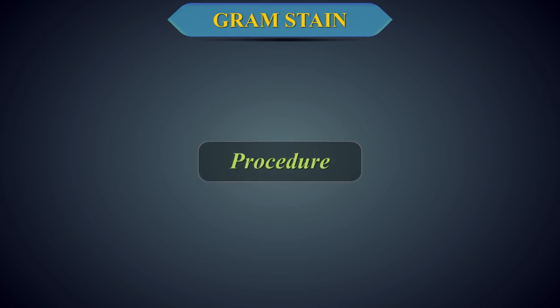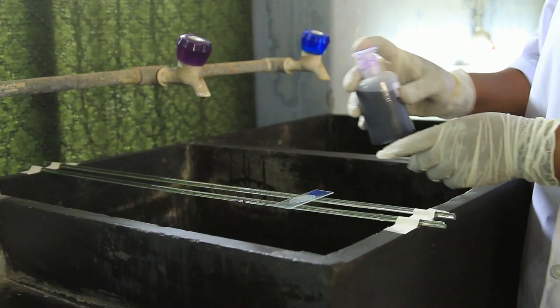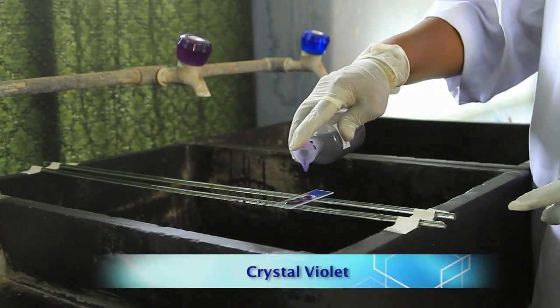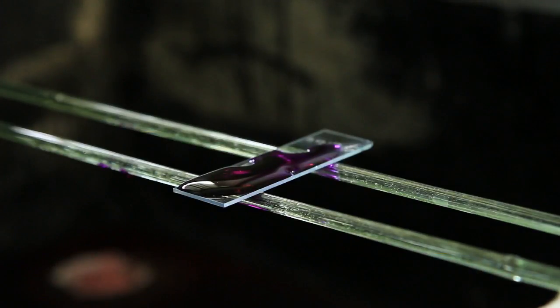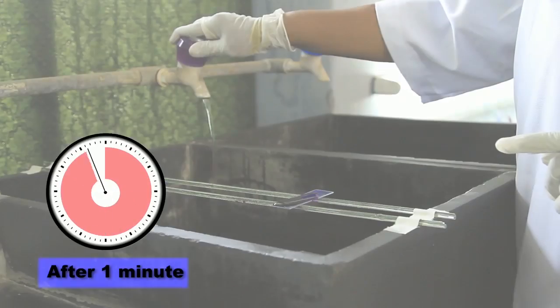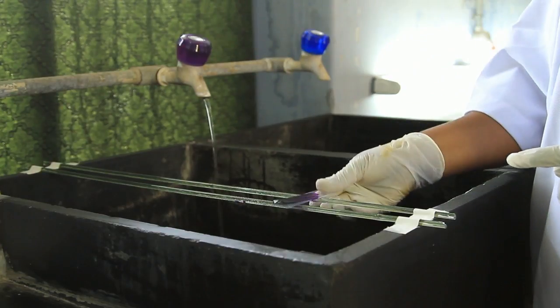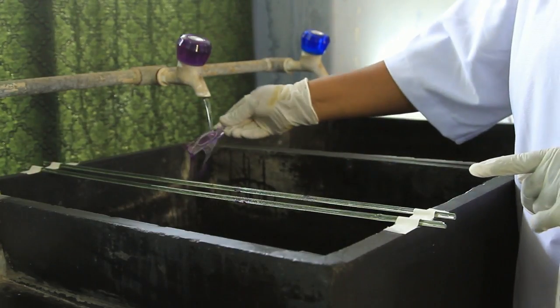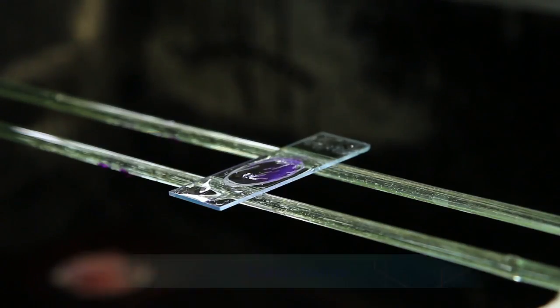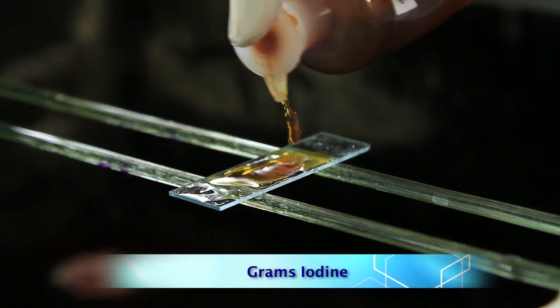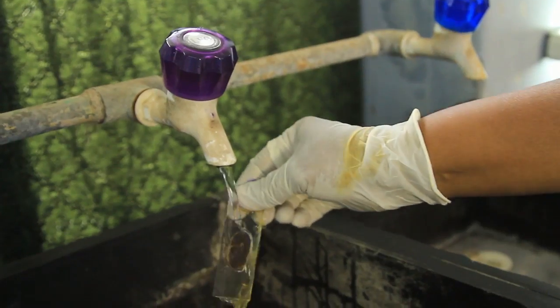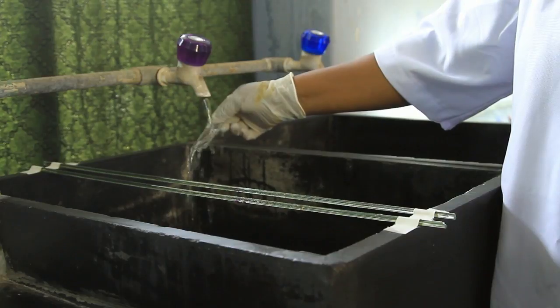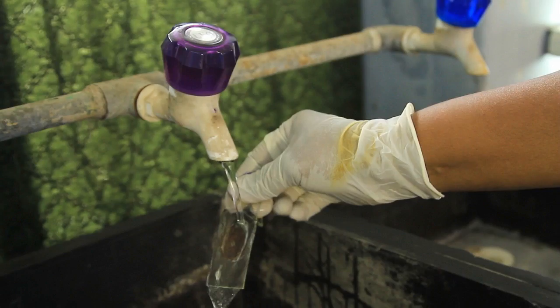Procedure. Place slide with heat fixed smear on staining tray. Gently flood smear with crystal violet and let it stand for one minute. Tilt the slide slightly and rinse with gentle stream of tap water. Gently flood the smear with Gram's iodine and let it stand for one minute. Rinse with a gentle stream of tap water. The smear will appear as a purple circle on the slide.